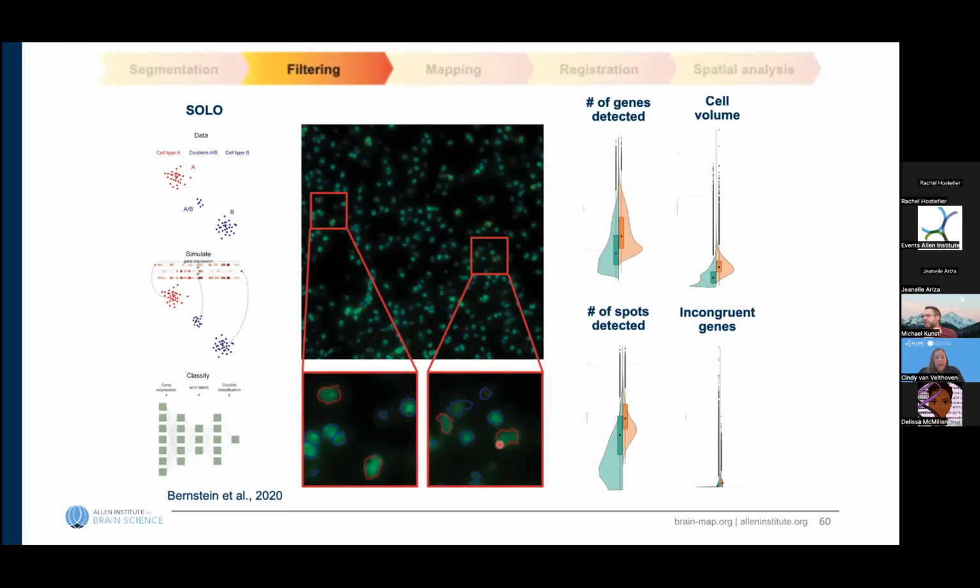In most of the cases, you can clearly see that there are two DAPI nuclei that are merged into one cell. Occasionally, there's a border case, where I'm not quite sure if this is really two, but you can clearly see these are two, whereas the single ones are obviously identified as singlets. We can again quantify using certain measures.